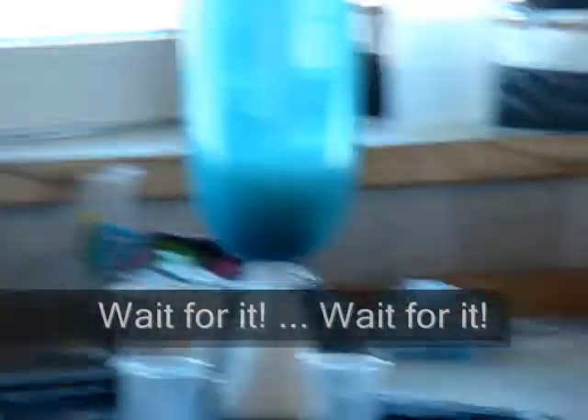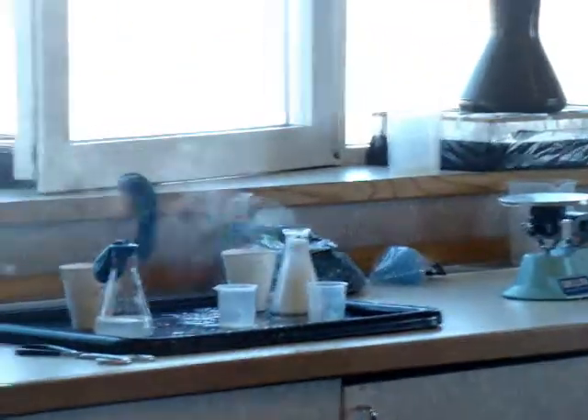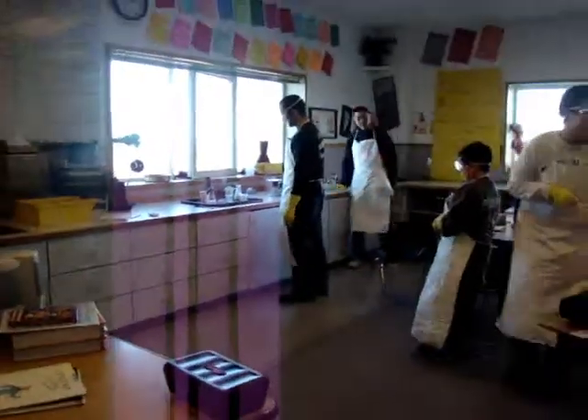Oh jeez, that looks so cool. Here it goes! That looks awesome - that would be really cool if the flask took flight. It's smoky. We very obviously overdid it. That was awesome.